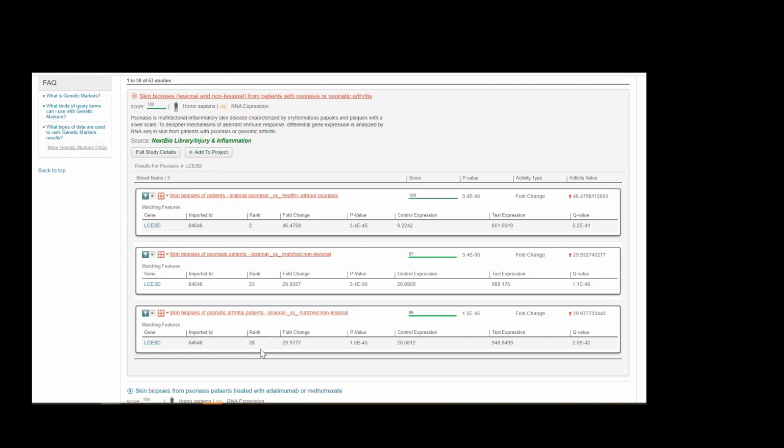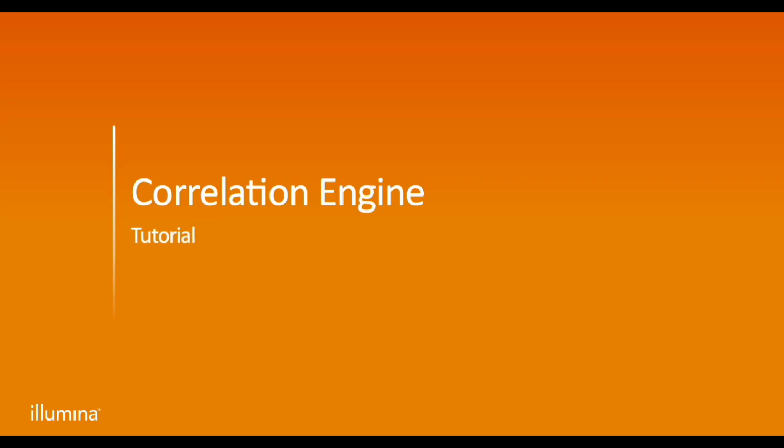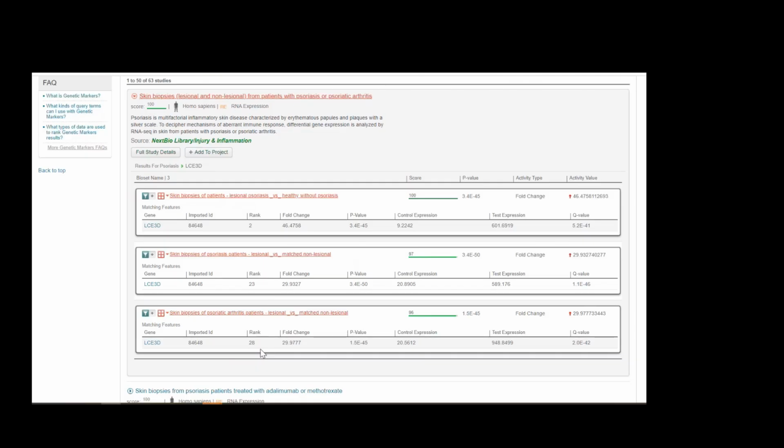The top rank of 1 is given to the gene having the highest absolute fold change. The maximum gene score of 100 is given to the top ranked gene, and gene scores decrease linearly as rank descends the list. This normalization step ensures cross-study comparisons at the gene level are on equal footing.